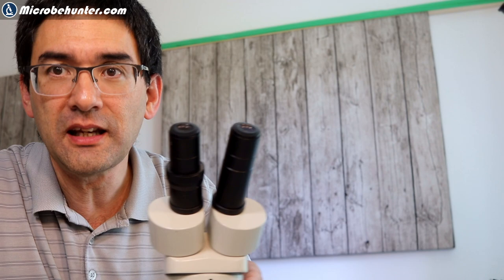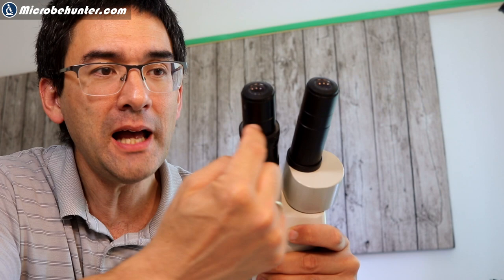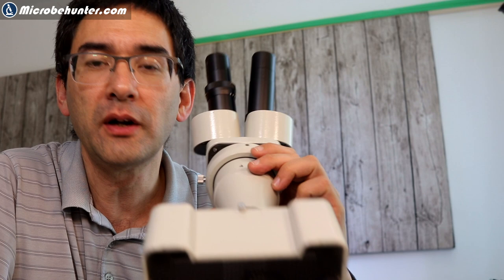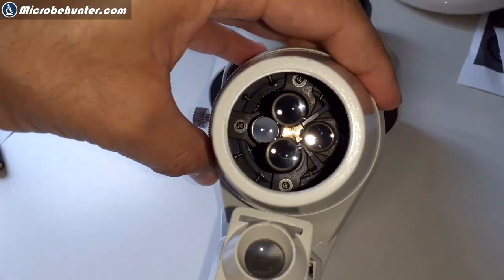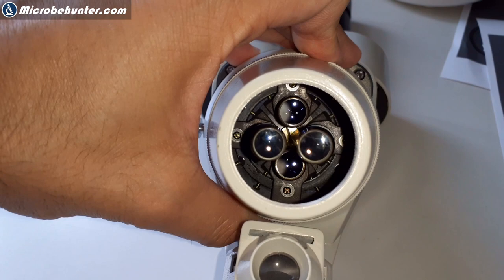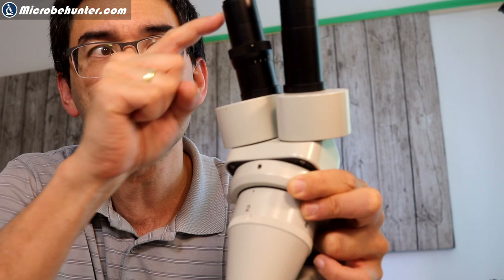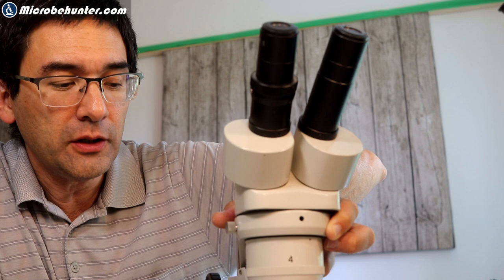What you need is a stereo microscope. I've got a smaller one here. The similarity to binocular microscopes is that it also has two eyepieces, but each eyepiece receives a different picture, and the image is upright because there are prisms inside that turn the picture right side up. You can see there are four lens elements — two are always used for observing, and the other two are used to change the magnification. Total magnification goes from 2 times 10, which is 20 times, up to 40 times.